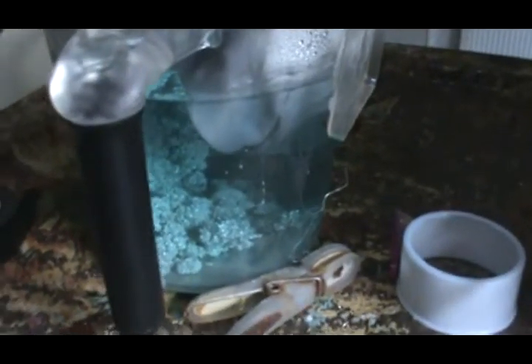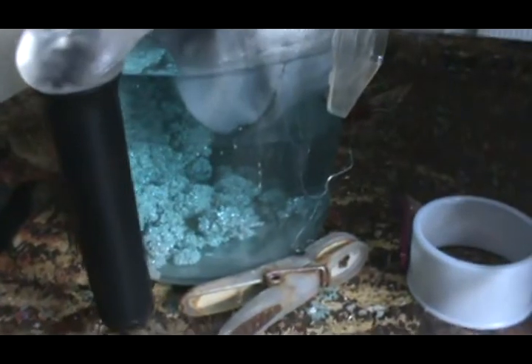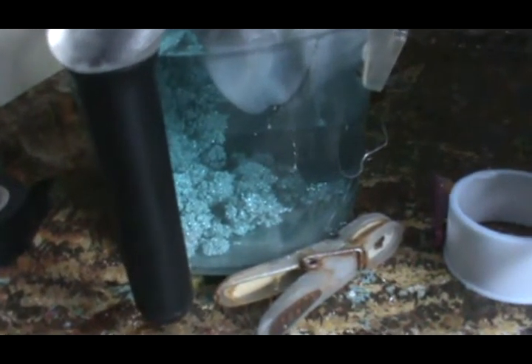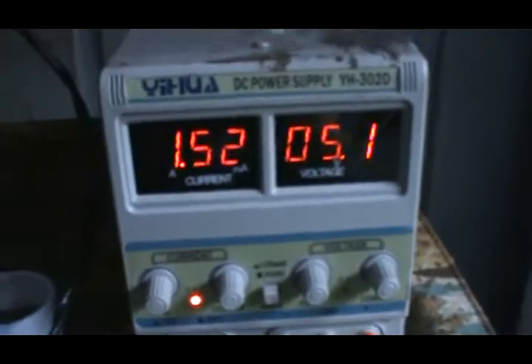The electrolyte you see in there is 120 grams of 999 silver dissolved in nitric acid — in minimal amounts of nitric acid. You can't use a lot; you've got to use just enough to dissolve it, and then once you've got that you water it down with distilled water to a thousand milliliters and you hook your power supply up.